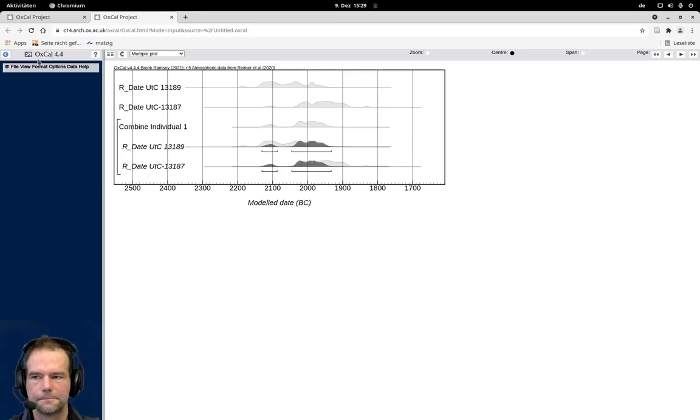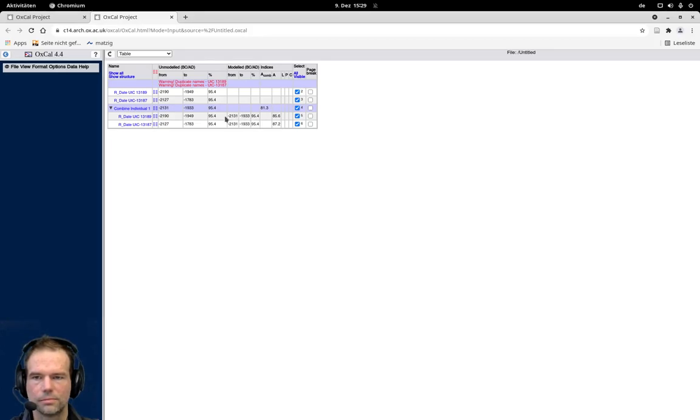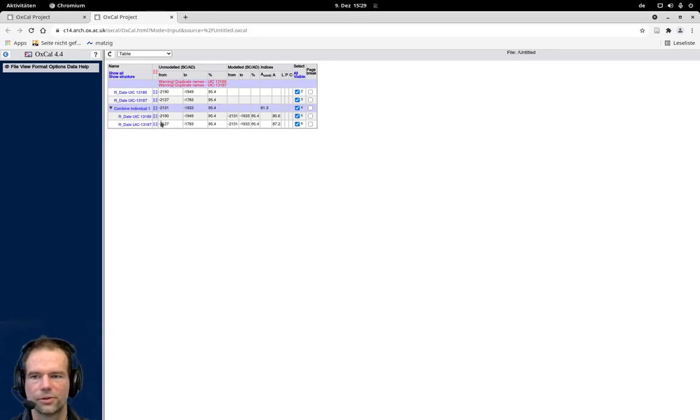Also we can see that in the table where we can see the combined, the modeled results here. You can see that OxCal gives us a warning here that there are duplicates of the name. That's not a surprise because we have pasted in the same dates multiple times here. So with that, this is not a problem here.